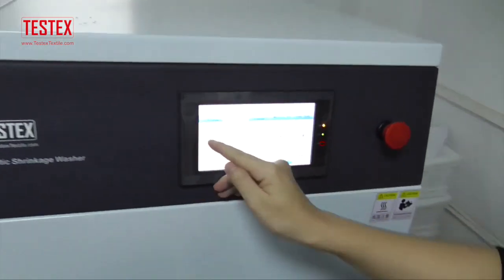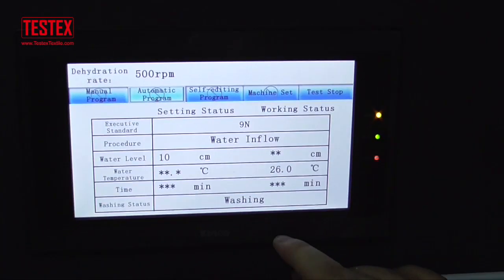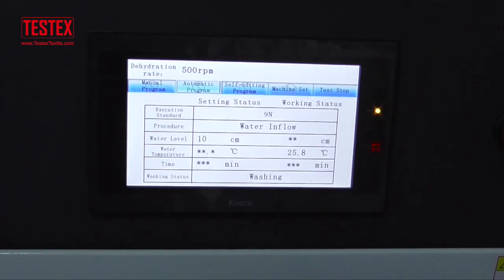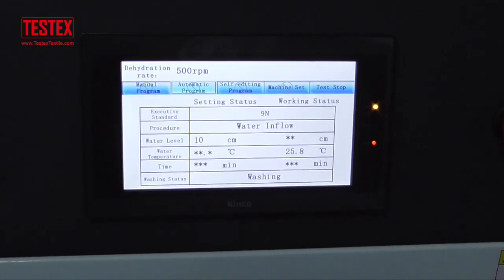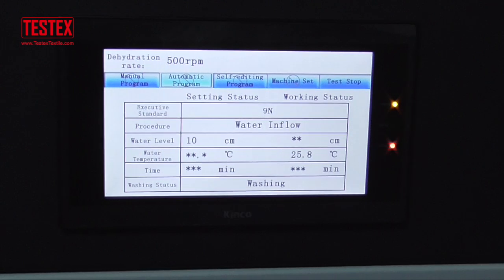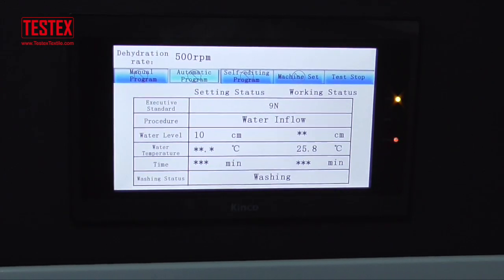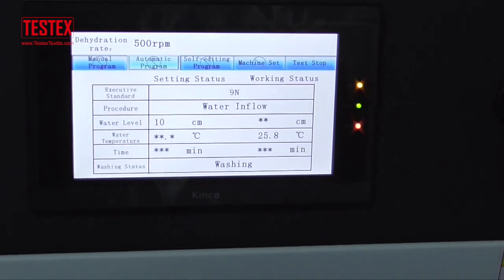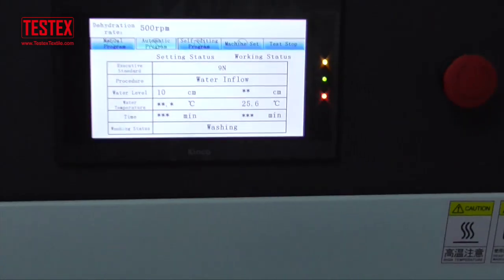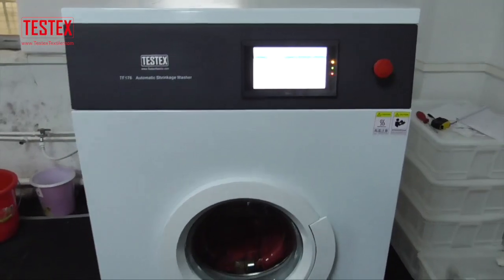And see this one and click the enter, and it will also take the test. And when the machine releases the test and releases the wallet, it will also store and emit at the end of the sound. And then the laser is done. This is all the use of this machine. If you have any questions, please check the manual.